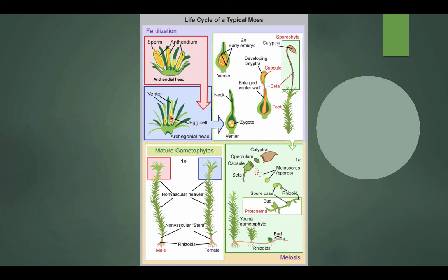And they're going to look at the sporophyte and have you be able to label things like the stalk and the capsule and the seta and the operculum and the spores in general, and ask you general questions about all of those, as in what are they, are they haploid, diploid, what are dominant stages, all of those things.